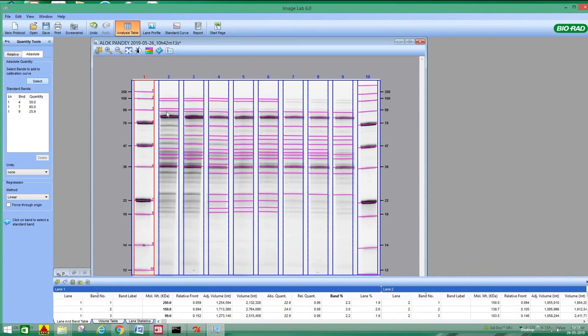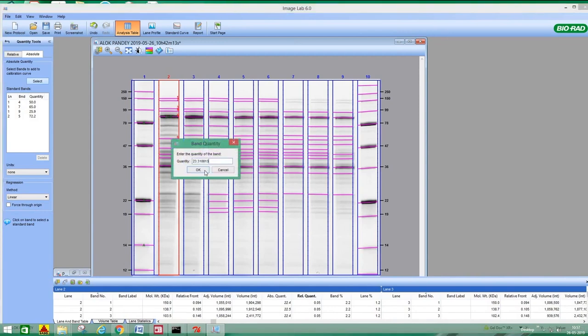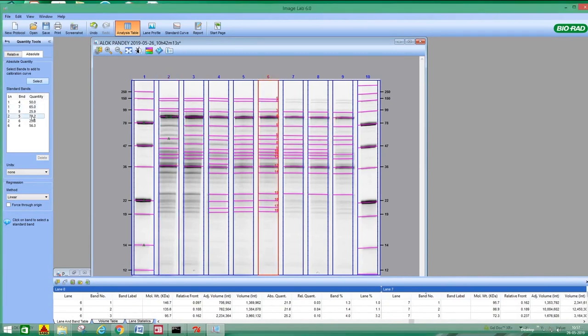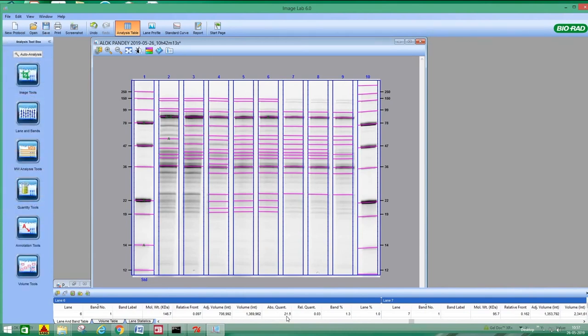So you just take your mouse pointer to any band you want to calculate the quantity, actual quantity. You can click on that one, it will give automatically 72.214 nanograms. You want to calculate this band, you just keep that one, it will give the value. In this way you can calculate absolute quantity of any given band in the gel. So you can export these results, or you can save from this one also.